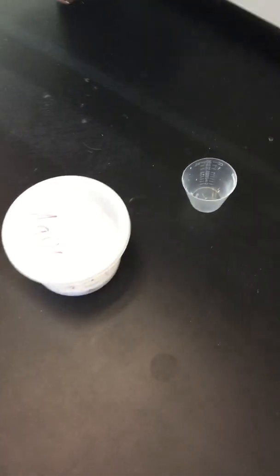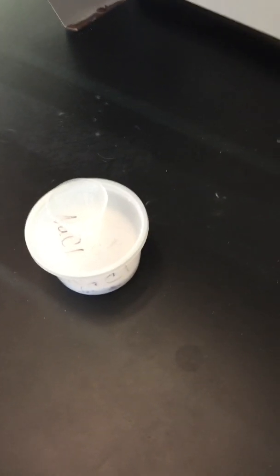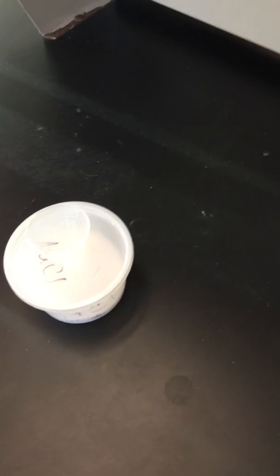Moving on to station 5. Now station 5 has sodium chloride, so we've got this nice tub of sodium chloride down here. Additionally, we've got this little measuring cup, and one of the things on here is teaspoons. So in the interest of time, I'll just tell you that I did this one earlier. I filled up a teaspoon of salt, and when I weighed it on the balance, that salt had a mass of 8.846 grams.